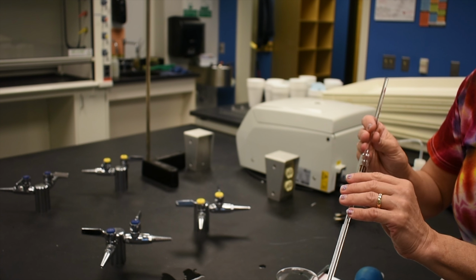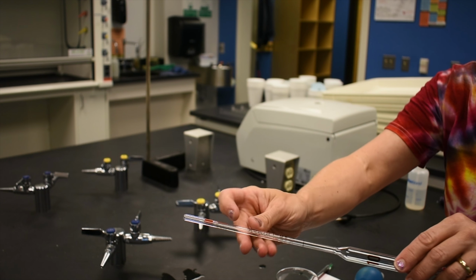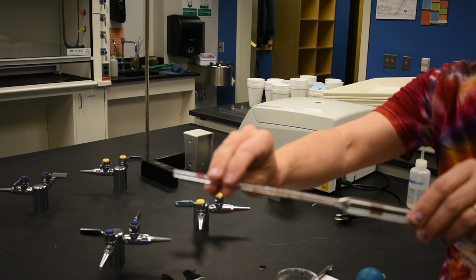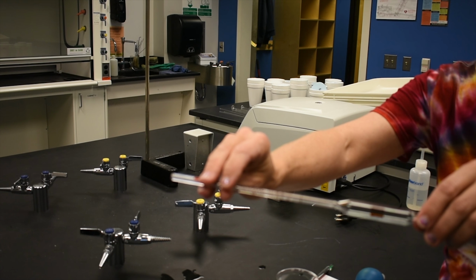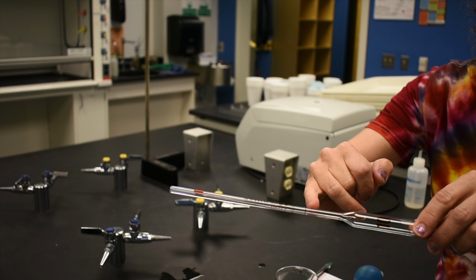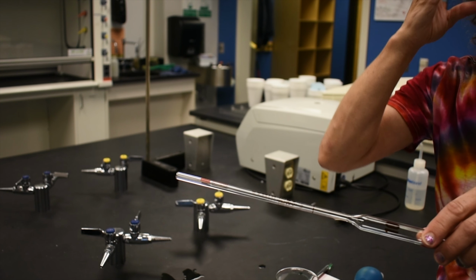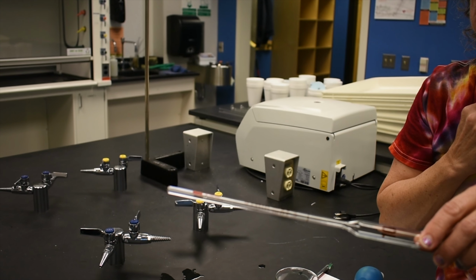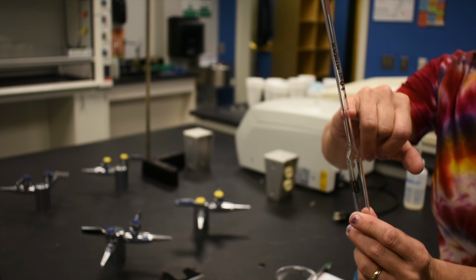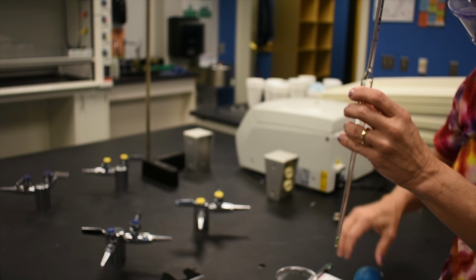We're going to use our 10 milliliter volumetric pipette that is set to measure exactly 10 mils. Now, if you can see on this pipette, there is a small line partway past the large portion of the pipette volume. This is the line that shows you exactly 10 milliliters. So in order to use this type of pipette, what you need to do is draw solution into the pipette until the bottom of the meniscus is exactly touching this small brown line. And we are going to try to do that.